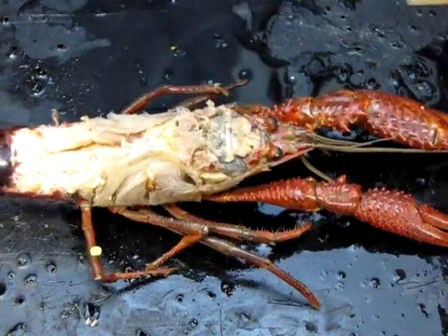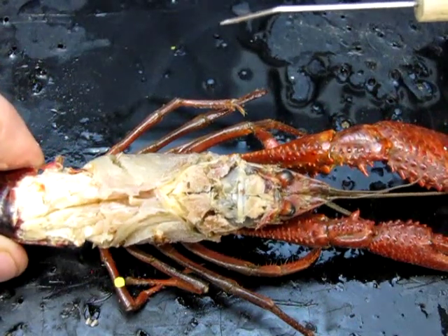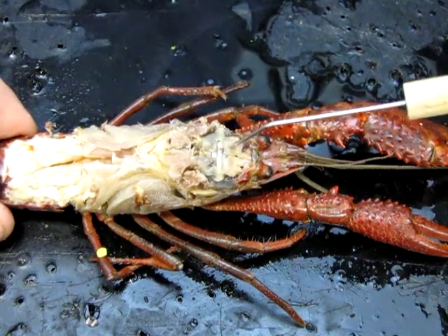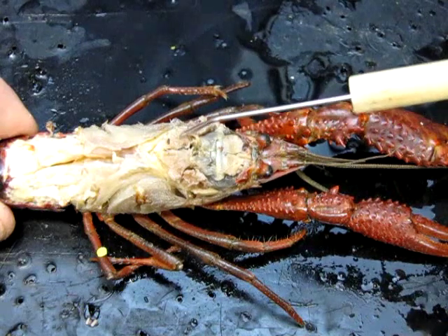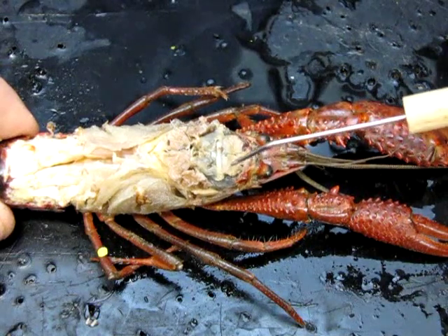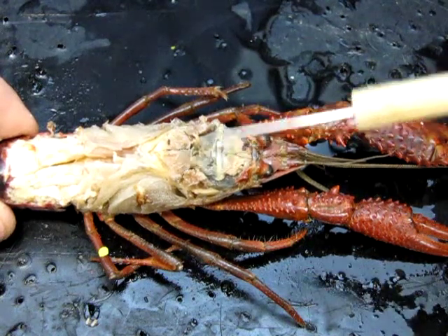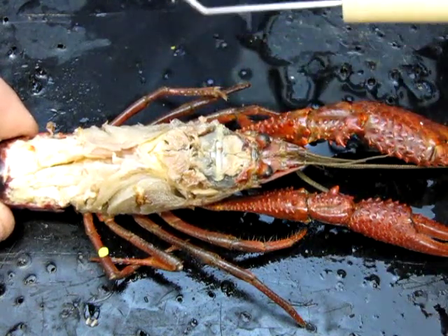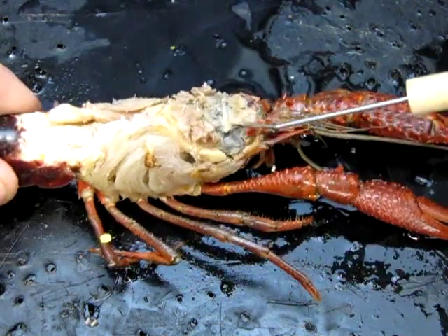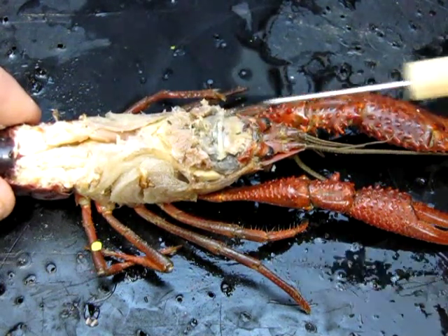I'm going to start with a bit of a tour of the musculature. One nice thing about this animal is that it has nice big muscles, which are easy to see, and we can talk about their different functions. We have one pair of muscles at the front — those are called the anterior gastric muscles — and one pair behind, the posterior gastric muscles. The word gastric refers to the stomach, and this is the stomach region. Those muscles are attached to either end of the stomach and provide some muscular action there.